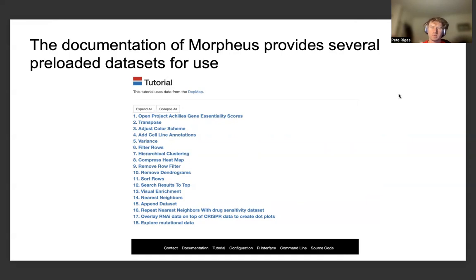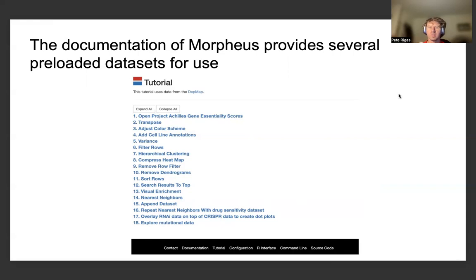It's also possible to look at different ways to construct heatmaps to annotate cells for viewing different purposes and functionality of cells, as well as being able to look at and interpret different FASTA files from a sequence or a collection of thousands or hundreds of thousands of sequences in isolation to perform different types of pointed analyses for many different purposes.